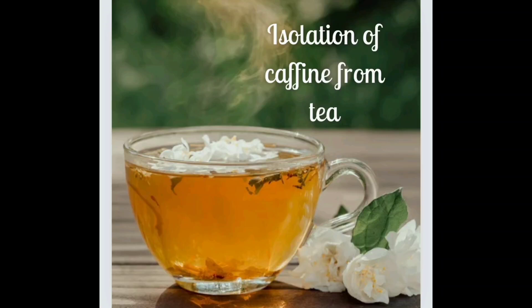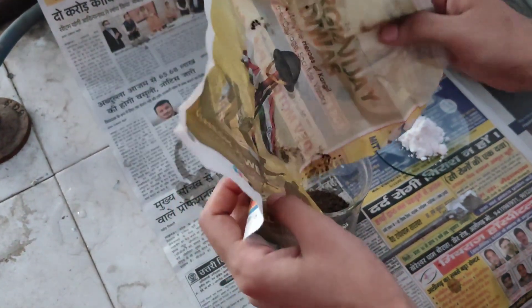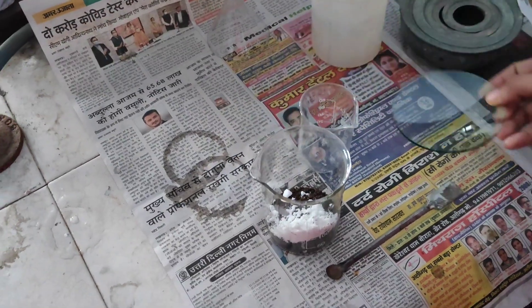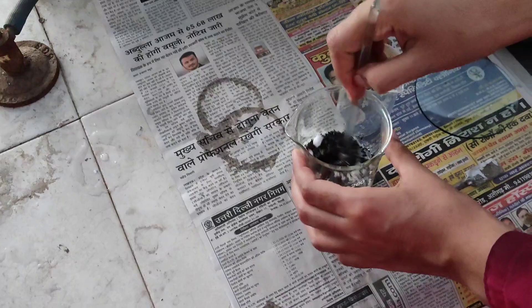Let's start the experiment of separation of caffeine from tea leaves. First, we take a sample of tea — this is 20 grams of tea leaves and 5 grams of sodium carbonate — and mix them together.